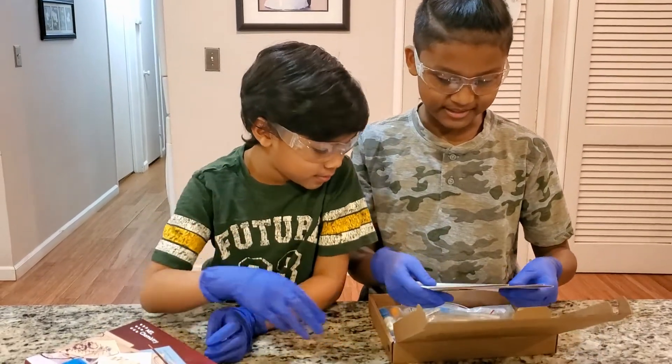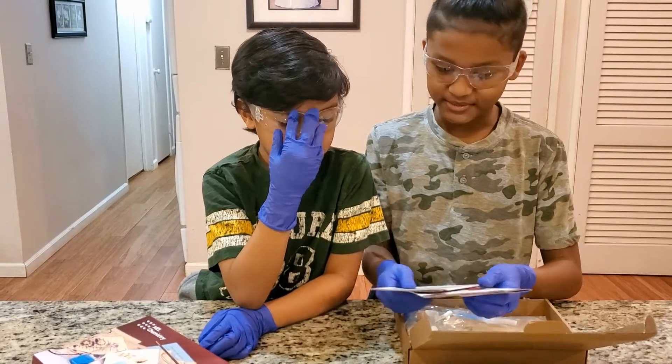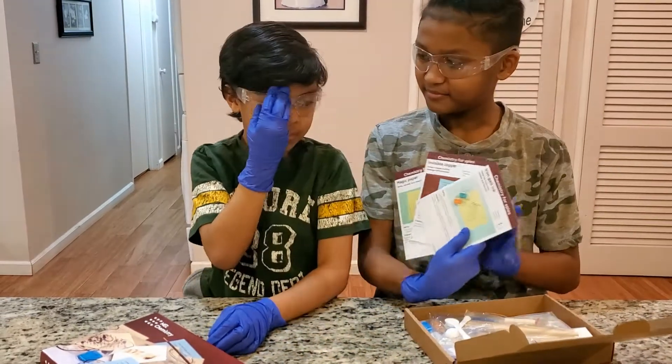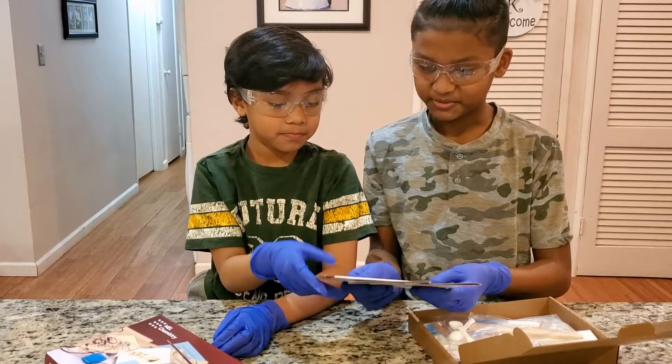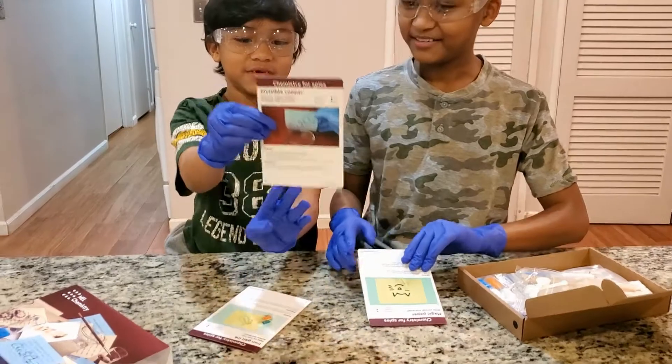Wow, there's a lot of them. Okay, there's three. Which one are we doing? There's three of them and we're going to do the Invincible Copper one.